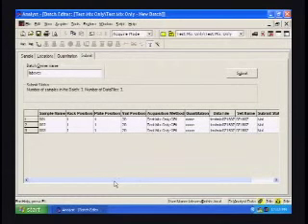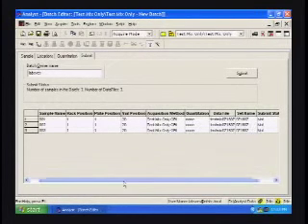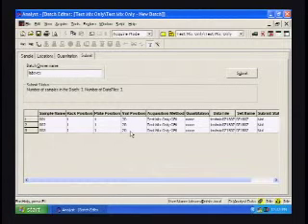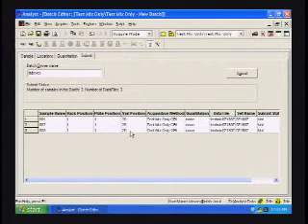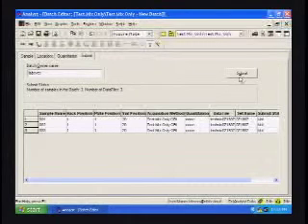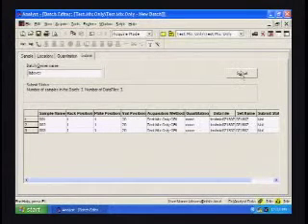We knew it was there somewhere. For demonstration purposes, the screen size is a little different than what you would normally use. And normally the submit button is readily available. So we're going to click on submit.